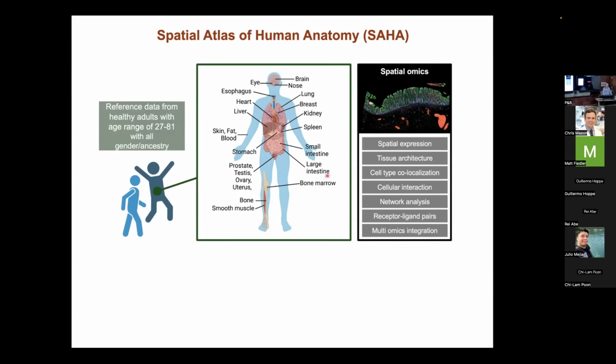And you can see here that we're looking at a variety of different tissues from the human body. The goal is not just to look at, say, the small intestine, which is huge, or the colon, which is large. We're also looking within the different clinical and anatomic regions of those tissues, because those tissues aren't just homogeneous colon. There are different areas where clinical anatomic designations actually have histologic, molecular, cellular differences within them.